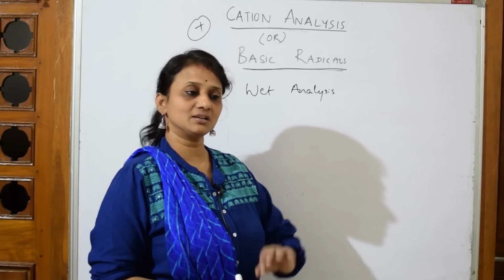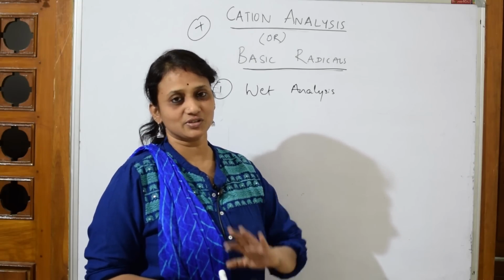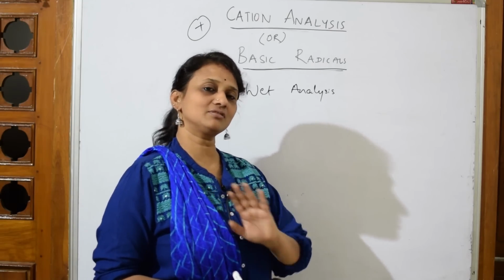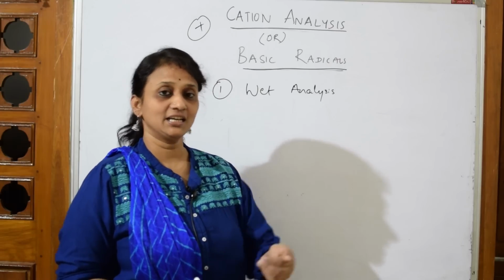Let us learn one trick, the easiest way, where all the anions and all the cations are covered. It took me a lot of time to frame everything and give it to you, so please memorize this and go. You can analyze the cation confidently in 10 minutes maximum. What is that? Let's see for a while.